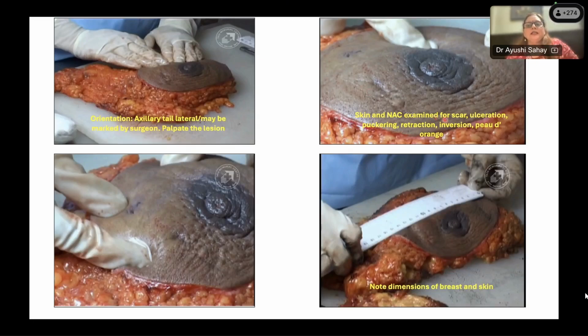Examine the skin and NAC for any kind of scar, ulceration, puckering, any kind of retraction, inversion, or peau d'orange that may be present on the skin. Peau d'orange is actually difficult to identify outside the breast, but sometimes it is so obvious that you can actually make it out. In the Indian skin, it is not very easy to make out. Then you have to look for any kind of prior stitch or scar of a prior biopsy site. That actually gives you a very good idea of where the tumor is located. And then of course you have to note the dimensions of the whole specimen and skin of the breast. This is not for any protocol, but for identification purposes, and the quantum of skin that has been removed.